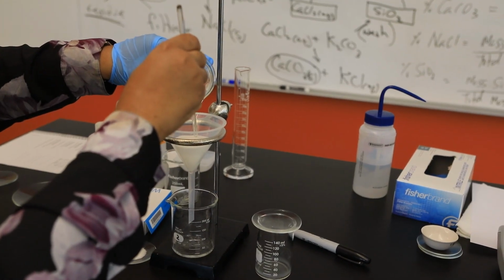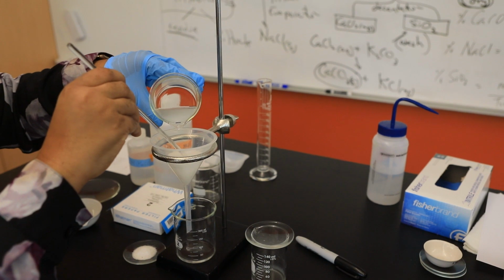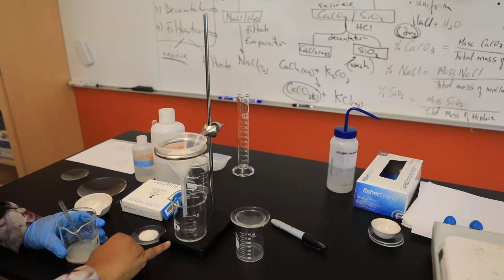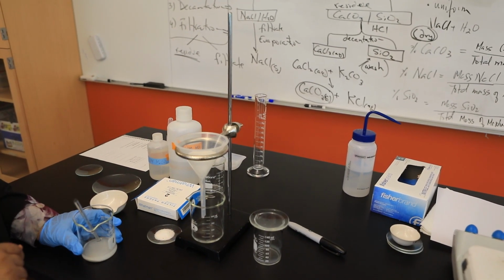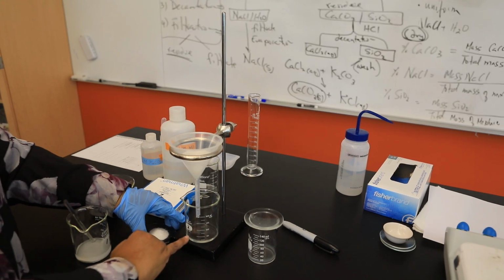We always want to make sure that we don't add too much solvent at a time, nor do I want to add any of the solid initially to clog that paper. Now, if the solution that exits is not clear and colorless, I will certainly know that I have a problem, and that there's probably a hole in that filter paper. Now, why do I say this?